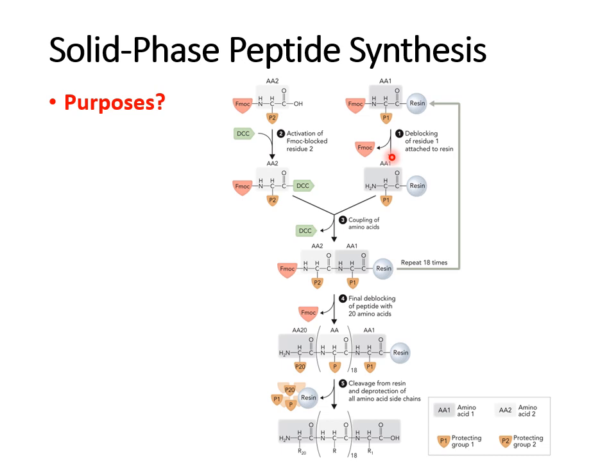It is basically an automated way to generate polypeptides, usually of around 25 amino acid residues. We call it quick, but it's within a few hours. And it's basically a 5-step procedure that you see mapped out for you here.